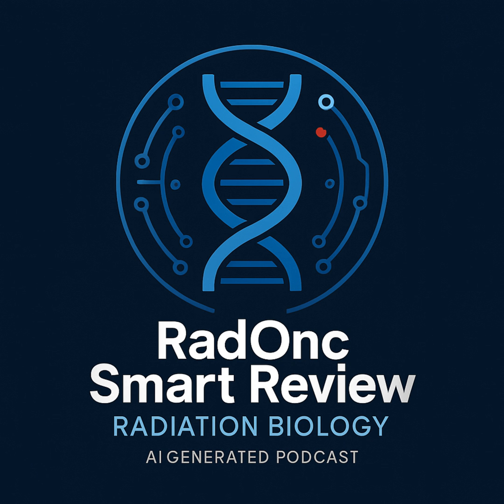Massively parallel sequencing. This really changed the game. It absolutely revolutionized genomics. Instead of sequencing one DNA molecule at a time, NGS platforms sequence millions or even billions of DNA fragments simultaneously. Illumina is a very common platform, but there are others like Ion Torrent, PacBio, Oxford Nanopore. The core idea is this massive parallelization. How does that actually work? Take the Illumina approach, for example.